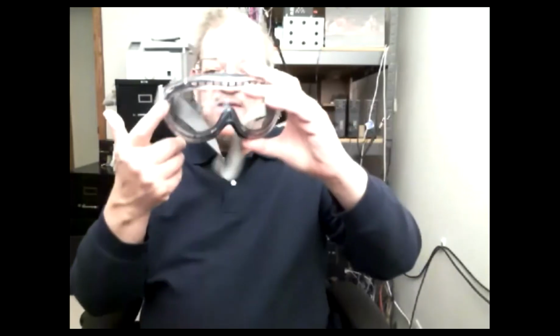Now, an important part of the lab is safety. We're not working in a lab in terms of you physically handling chemicals. And normally at this point, I would be showing you about a 40-minute video on safety if we were face to face. Good news, I'm not going to show it to you, but I am going to cover some important points. When we talk about safety, one of the most important things is protecting your eyes. And glasses alone won't do it. At COD, you have to wear safety goggles, not glasses, and these protect your eyes.